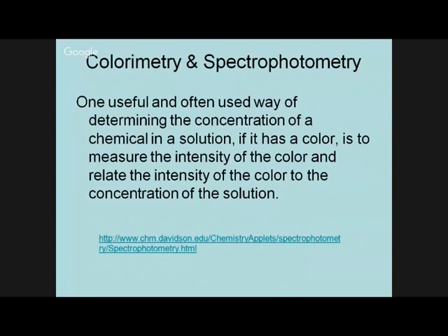Then another very important aspect in the analysis is the use of a spectrophotometer or colorimeter. Most of the ions, such as phosphate, NO3 or chloride, and most of the heavy metals as well, are analyzed using the spectrophotometer. Some of the spectrophotometers are the UV-Vis spectrophotometers, and for the heavy metals there is the AAS, atomic absorption spectrophotometer, that is used for the estimation of heavy metals.